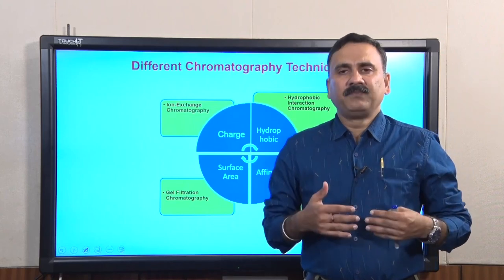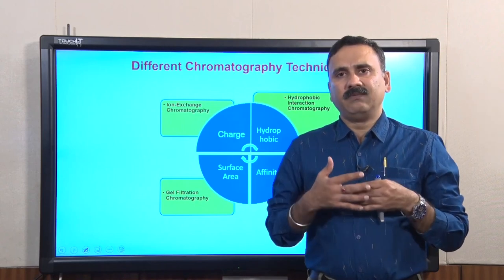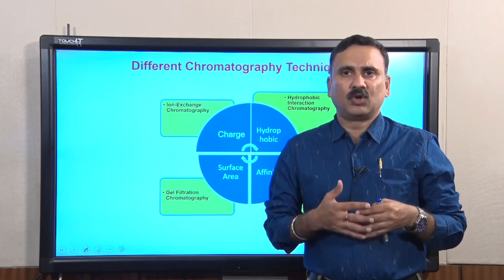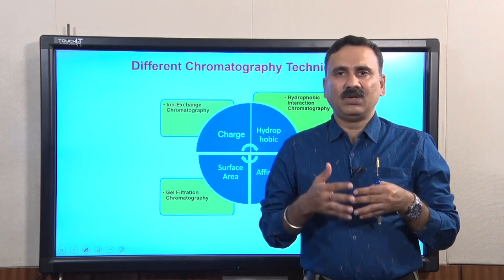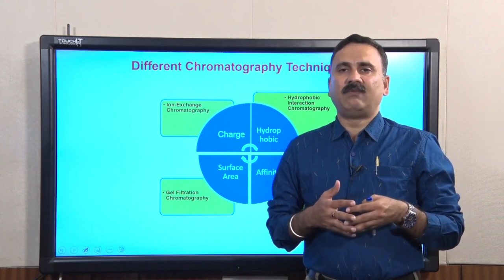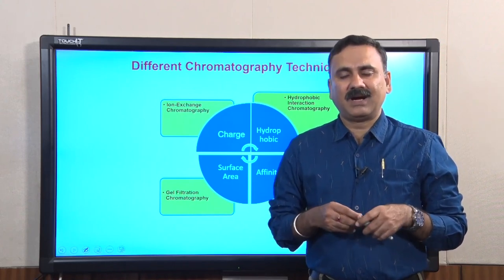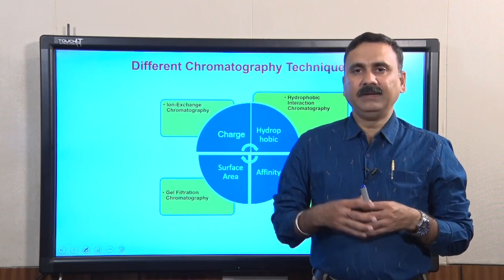And now today in this lecture we are going to discuss about the different types of affinity chromatography and how to perform these chromatography, and at the end of this lecture we are also going to discuss about the application of affinity chromatography. So let's start with the first examples of affinity chromatography.